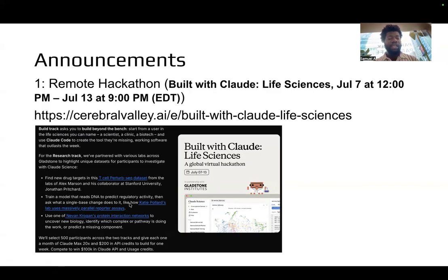My opinion is that this will involve multiple tools, and you could use Claude Science, or even Claude Code, to reason about the steps and use Claude Science to implement them. I will show you Claude Science in a moment as well.